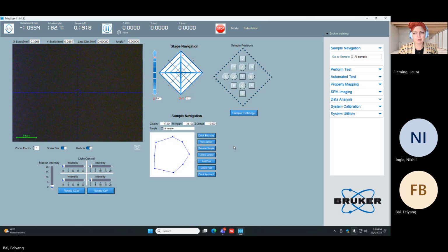Okay, good. So first two questions are answered. Hardware is done. Indentation axis calibration is done for the day. Our samples are well defined. So I saw you open the workspace where we had previously defined our samples. That's great. So now I just want to check these sample boundaries. I don't want to just trust them blindly. What I'd like to do is check the extremes, like the top, bottom, left and right of both samples, just to make sure that the sample zone that's defined is correct for the sample, that it hasn't changed in the software update.